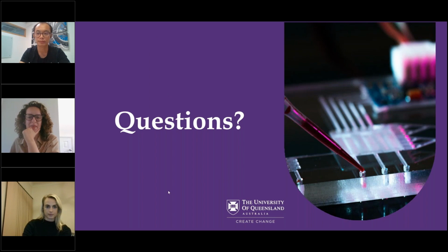Great, thank you. And then Anna, are there any different mechanical properties between the hydrogels that could affect the experiment? I know you used alginate and agarose. Yeah, there are, especially things like pore size. If we're looking at an enzyme having to penetrate or a cell having to be encapsulated, alginate has a far smaller pore size. I think it's around 9 nanometers, don't quote me, whereas agarose has one that's around 100 nanometers. So it gives you a little bit more room to breathe. We found that agarose was also a bit stiffer, so the particles held up a little bit better than our alginate particles did when you put them under a little bit of force or rough handling, I guess.